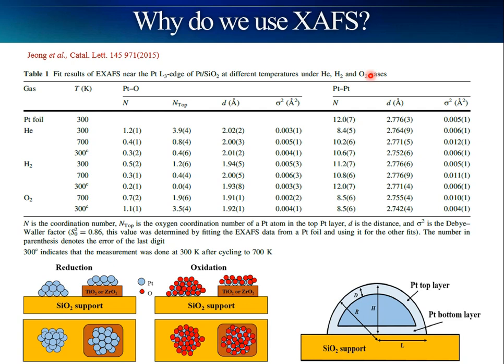There are local properties such as the atomic coordination number, the bond length R, and the Debye-Waller factor sigma square, which includes thermal disorder and static disorder. These are the local properties for each shell, the platinum-oxygen shell and the platinum-platinum shell.